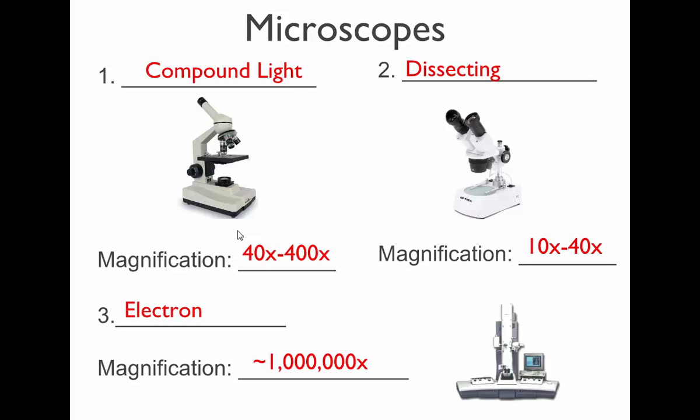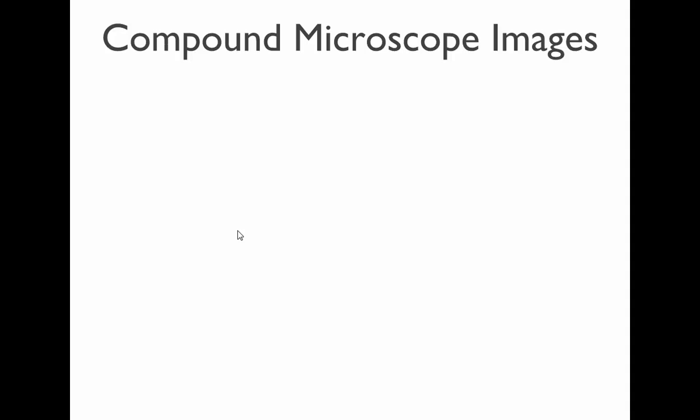My friend said that they were doing a microscope here before, and what is the one that you can see the cells moving inside of it? A compound microscope, you can see cells moving. Oh, that one has to be plugged in. It's just different. These are newer. We just got these this year, and they have a battery-powered light source. These don't. They just have to be plugged in.